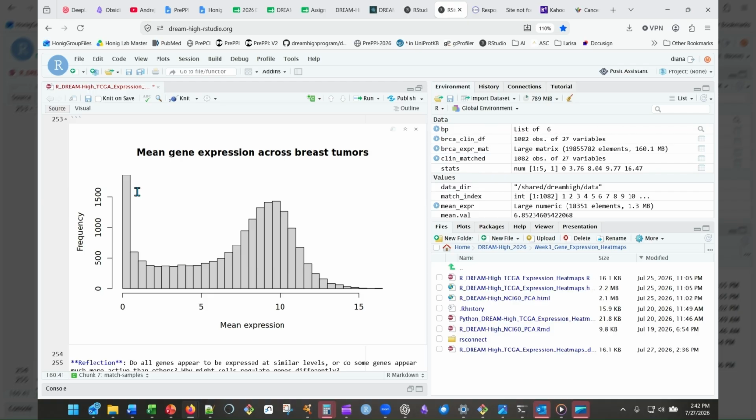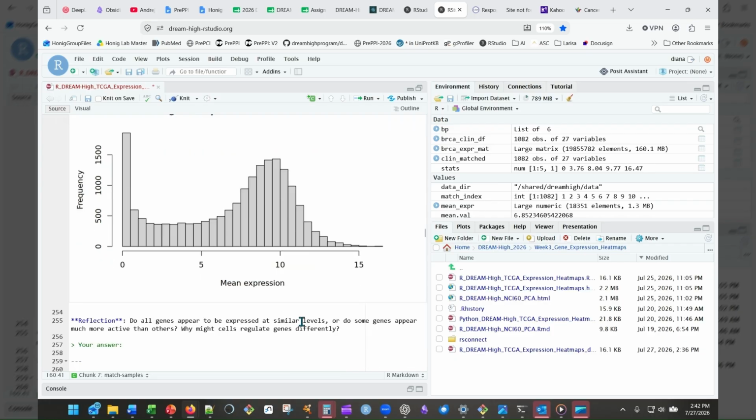We have this business here at the end in this tail, but based on what we know from experience, this is a very good normal distribution. We don't see this very often, so we're going to move forward. And this is what it means that data is dirty or tricky to deal with. So we have to sometimes take what we get.